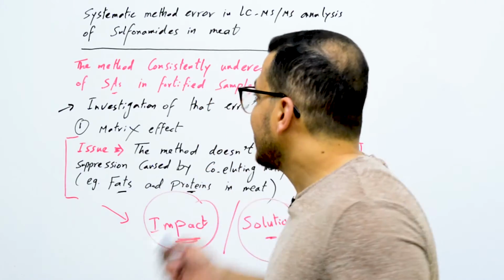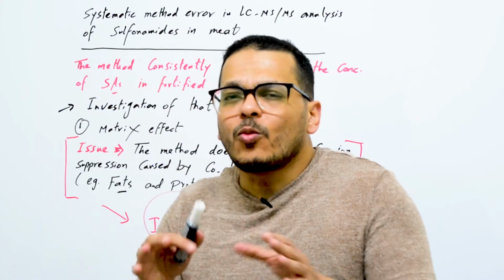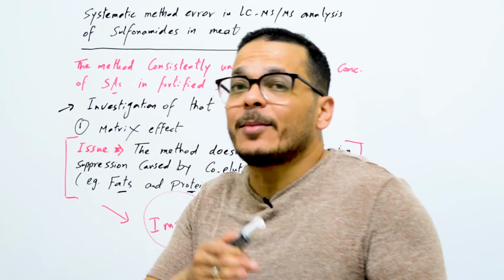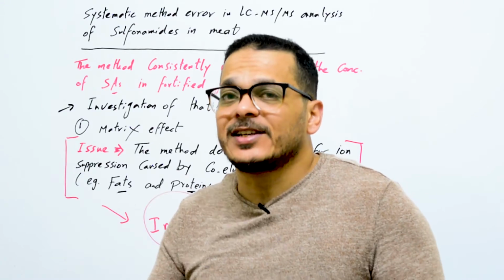In this case, you should make an investigation to know where this error comes from, then you can fix it, because it's consistent. So this is systematic. It will happen every run and also will affect every sample in every sequence.